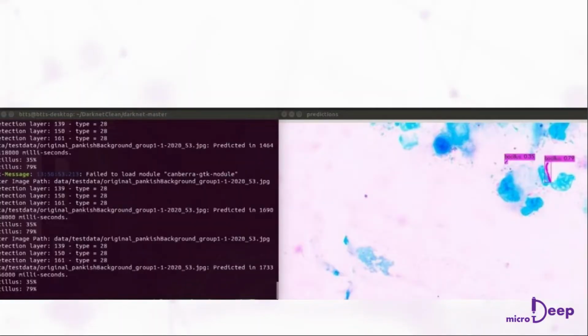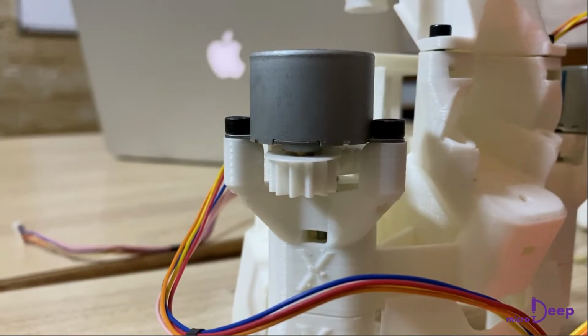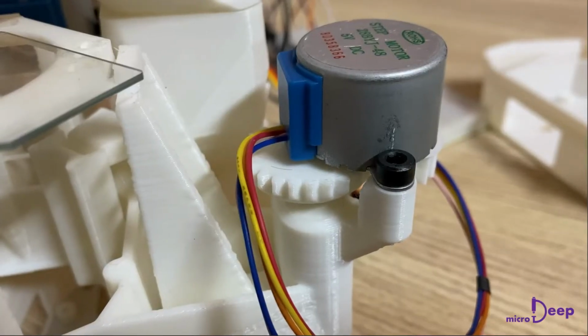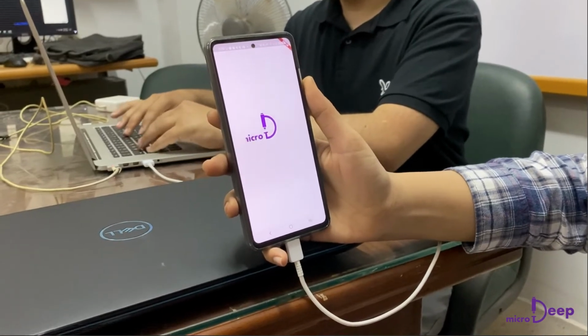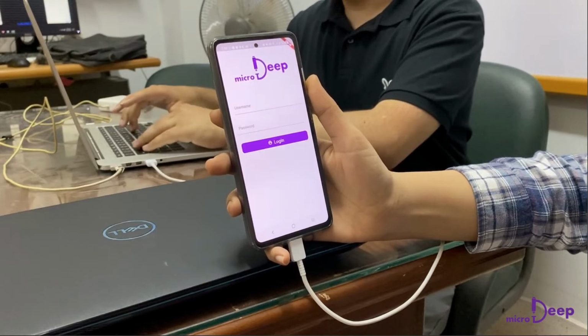A special-purposed camera has been mounted on the microscope to feed the NVIDIA Jetson Nano with real-time images of the pathology slides. The microscope would also traverse through the entire slide using a special robotic mechanism to avoid human interaction with the samples during the scan.